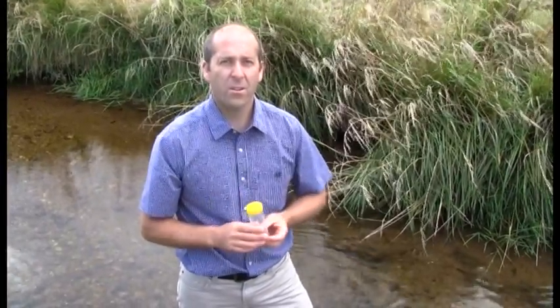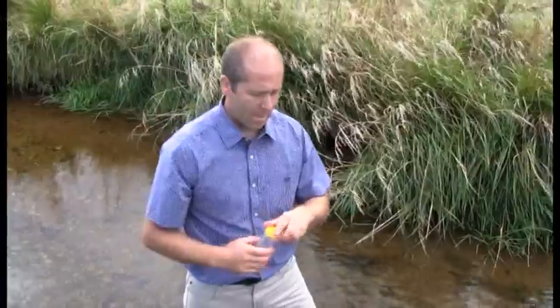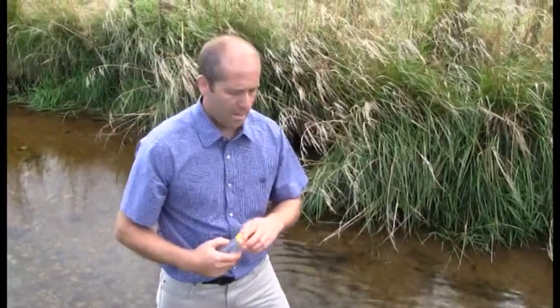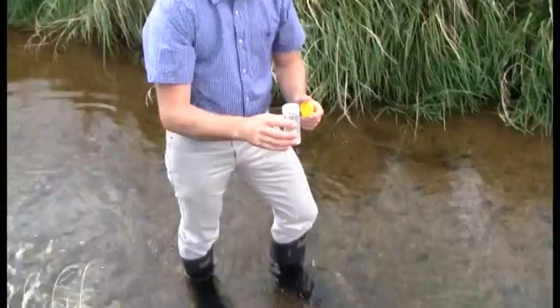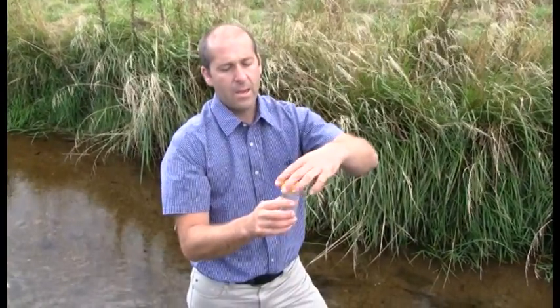For the E.coli sample, it's usually a sterile bottle, and by rinsing it you can actually introduce contamination. So it's best just to take a single sample once without rinsing. The same method applies: plunge it neck downwards into the water and then tilt it so it's facing upstream. Fill it to just about a centimeter below the top of the container. Cap it tightly and be sure not to touch the inside of either the lid or the container.